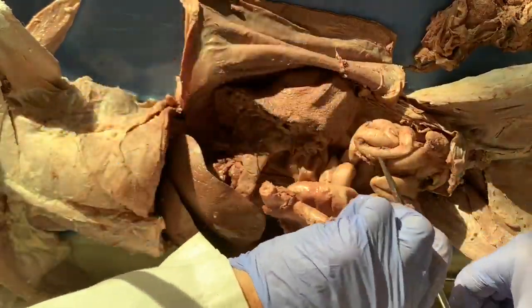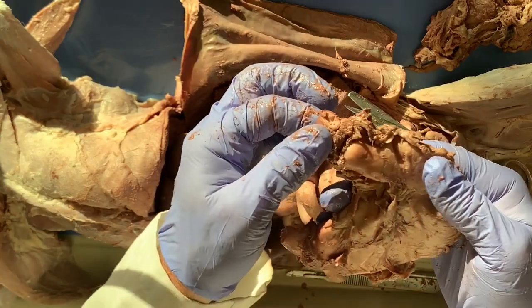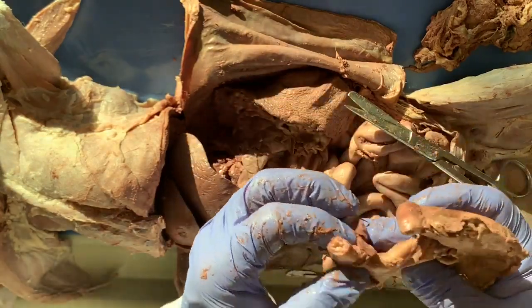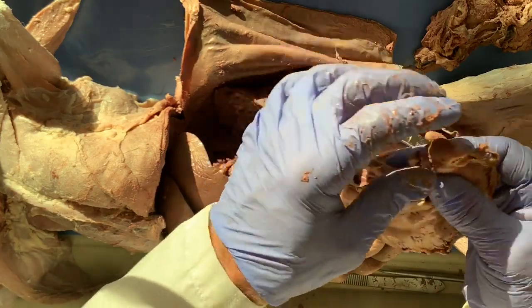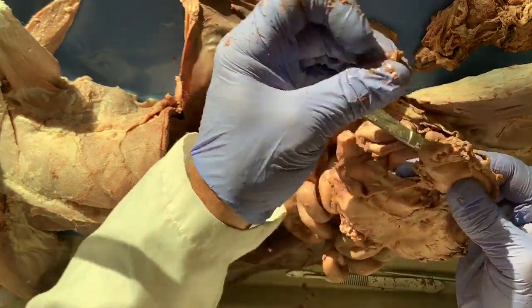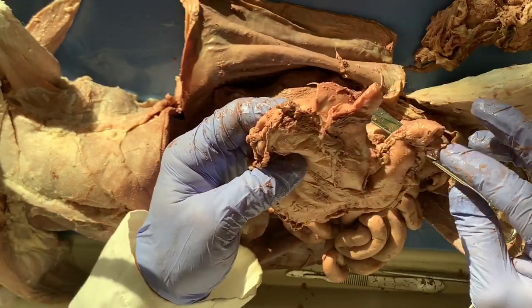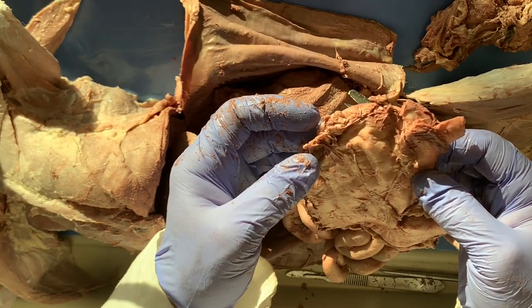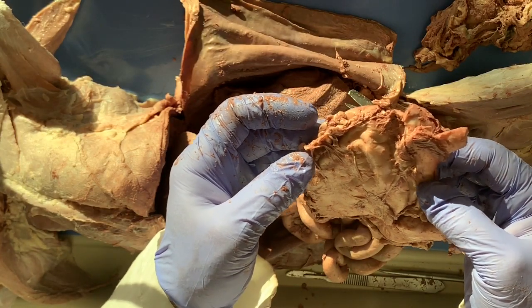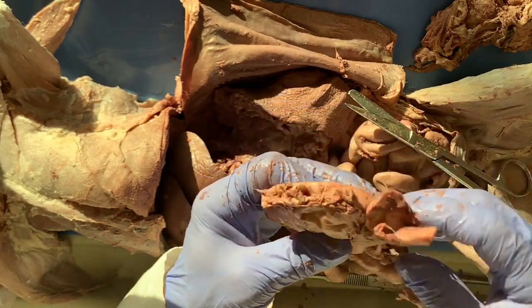And then there it is. Okay, so this is the esophageal end right here, and then this is the duodenum and the pylorus, where it comes out into the intestine. Okay, so I'm going to stop the video here real quick, and we'll do a close-up of the stomach.